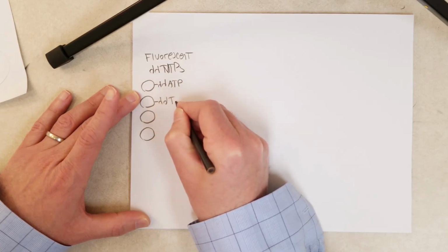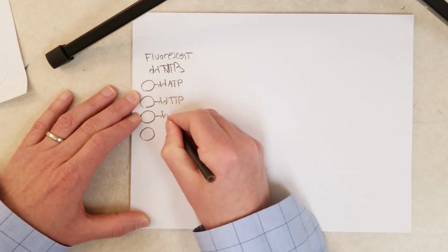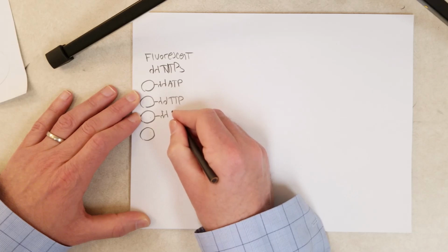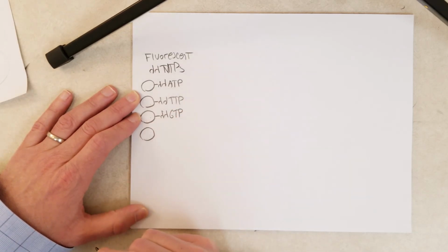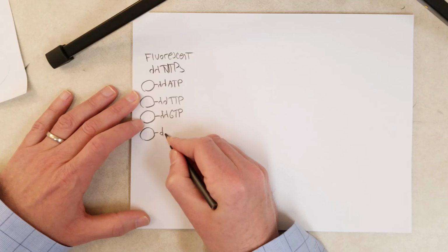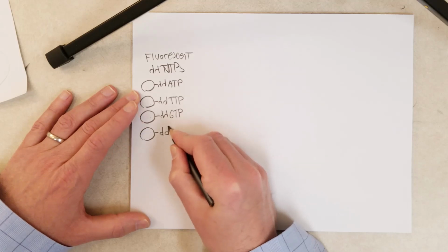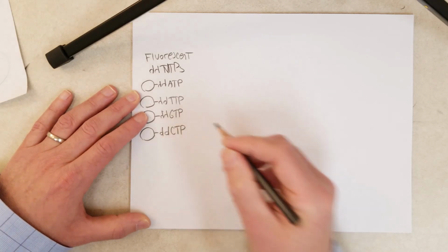But I'm putting a fluorescent molecule on all of these. And in some technologies, where the dideoxy is lacking the hydroxyl group on the 3' carbon, they actually attach the fluorescent molecule to that 3' carbon. But you can also attach it to other places.